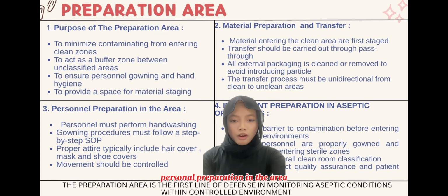Personnel preparation in the area. Personnel must perform hand washing and gowning. Procedures must follow a step-by-step SOP. Proper attire typically includes hair cover, mask and shoe cover. Movement should be controlled.